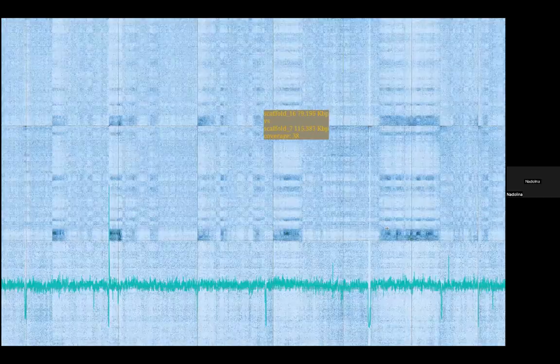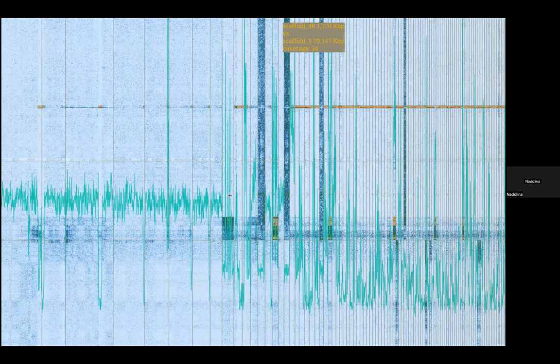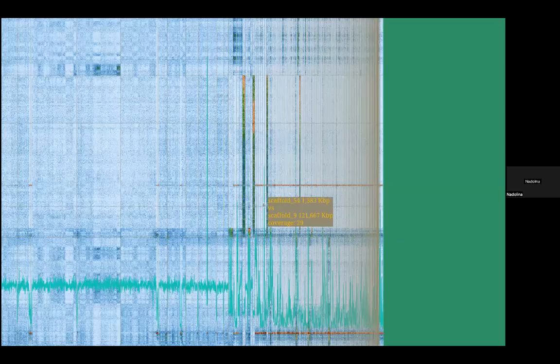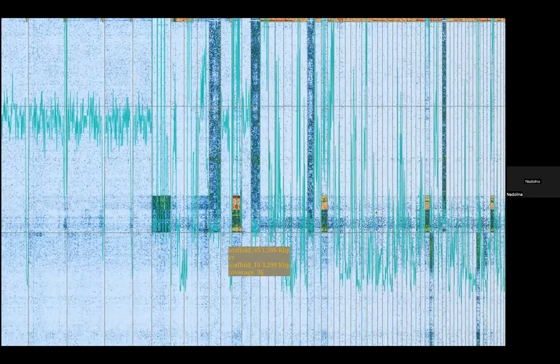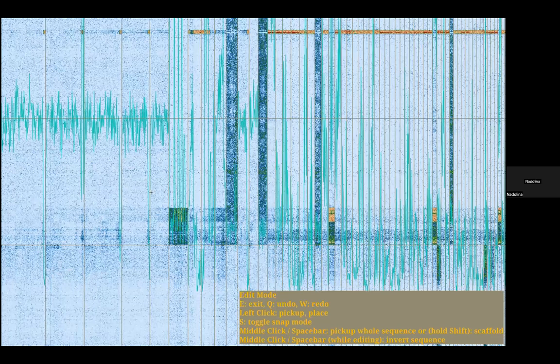Let's see. So we're going to go basically just along, follow that dip and signal. Oops, a little too far in. And we'll see if anything over here interacts. It looks like there's quite a few interacting pieces around here. All these pieces probably belong in there. You can see all of these pieces down here that are showing pretty strong interaction. And I think these are pieces that probably form the PAR, and they're probably connected to the Y chromosome. So let's see what that looks like when we bring it over.